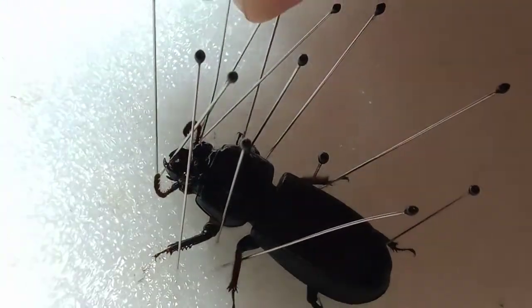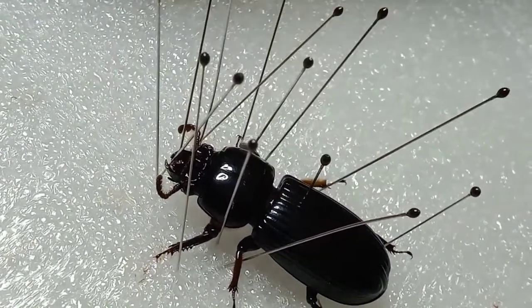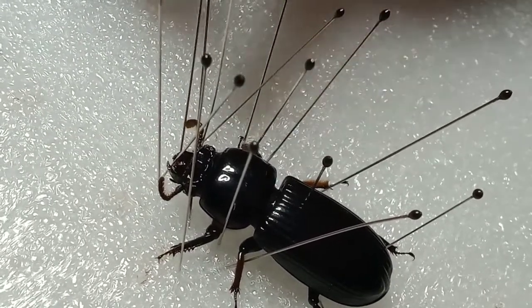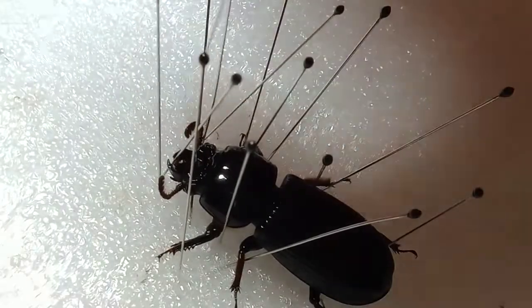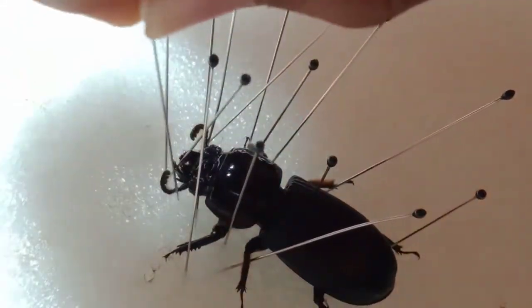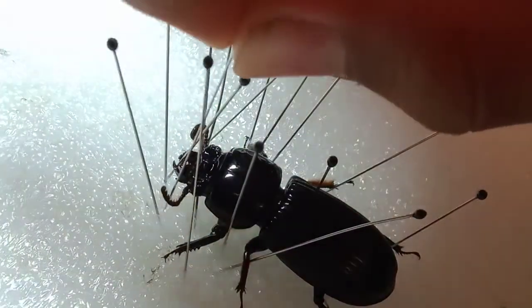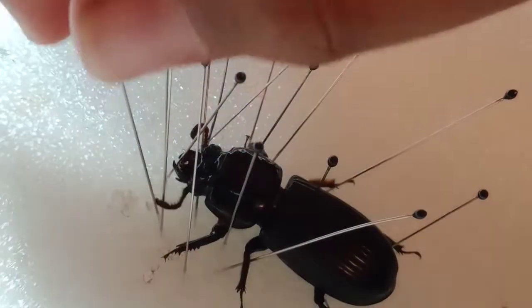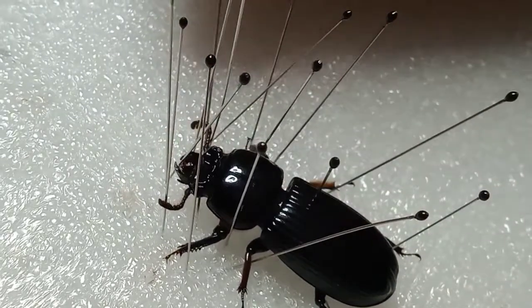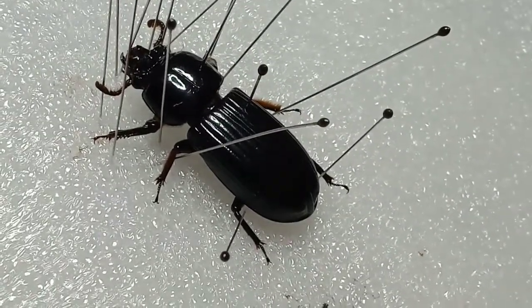I'm going to try to fix the antenna like that. There you go. That is how you pin a beetle. This is how you want it to look like.